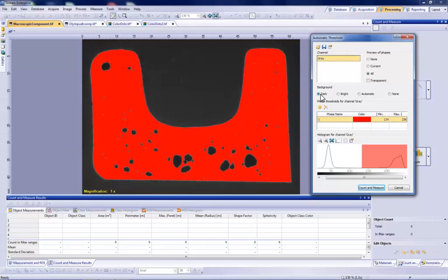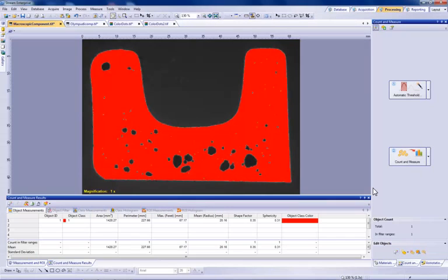This way the detected threshold will be on the large U-shaped material. We want to perform this selection first so we can easily define our region of interest as the large U-shaped area. The other method of defining the region of area would be to manually trace around the edges defining the border. This method is faster and allows the software to automatically detect the edges based on threshold. Now we click Count and Measure. Now we can see the software detected one large object.